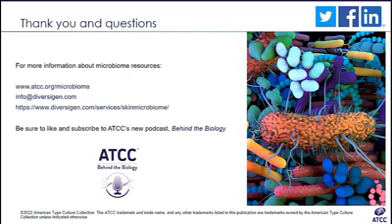Yeah, so that's a great question. I think I mentioned sequencing depth at some point. We don't do amplification of the DNA in skin microbiomes. We know, for example, from virome sequencing that when you amplify the genomes, you can get some biases towards certain DNA viruses. So I would suspect if you do that with skin microbiomes and shotgun sequencing, you can get some biases towards certain bacterial species versus other species. So in that sense, you will have to find that balance, as I mentioned, of getting enough sequencing coverage to detect all the microorganisms that you are probably expecting from your skin microbiome samples.